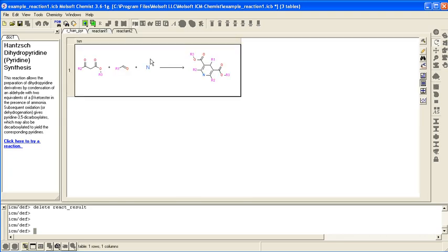Then for third we have nitrogen. This is how our final product is going to look.